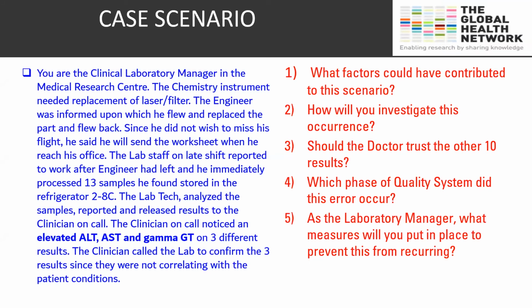Willie Brand says the lab personnel. Sorry. No, it's okay, Franklin. I was just going to say most of the answers are talking about lack of calibration of the machine and lack of communication between the laboratory and the engineer. So that's for question one. I'm guessing we can move on to question two. How would we then investigate this occurrence?